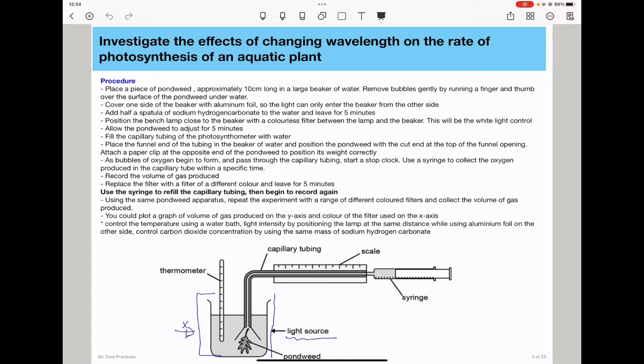You will need to record the volume of gas produced, maybe in a table, so that you can be able to repeat experiments and calculate the mean. You will then replace the filter with a filter of a different color and leave for 5 minutes before you do the experiment again. That is at this point here. Remember in the first point we had a white filter. Now we are going to use a different color filter so that the experiment is exposed to a different wavelength.